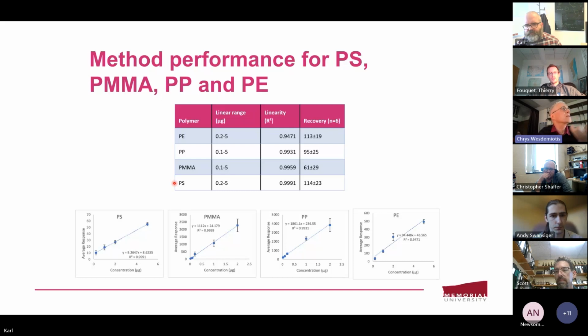Like things that were done to figure out the mold efficiency. You remember Kevin Owens and other scientists took mixtures to analyze them to see the difference in the efficiencies. You can do the same thing now with your method, to see if you have a 1-to-1 mixture, whether one is advantaged versus the other. So this data that's shown here, I'm quite sure was collected by mixing the polymers together.